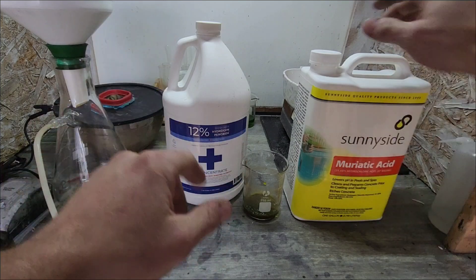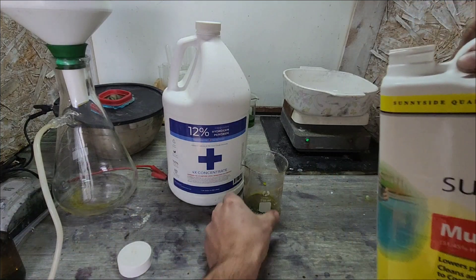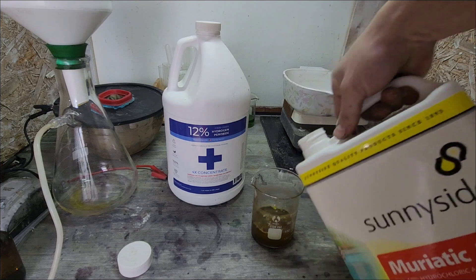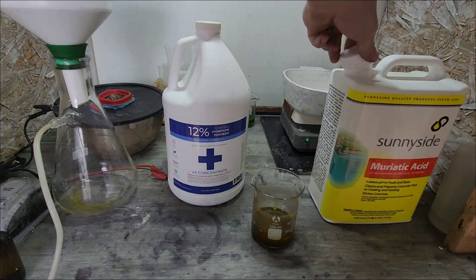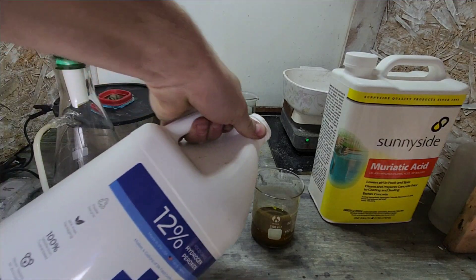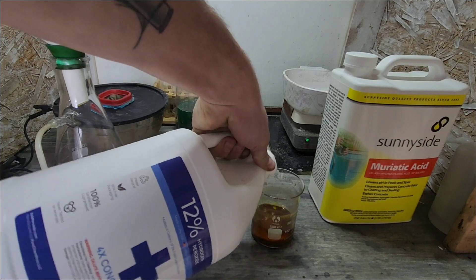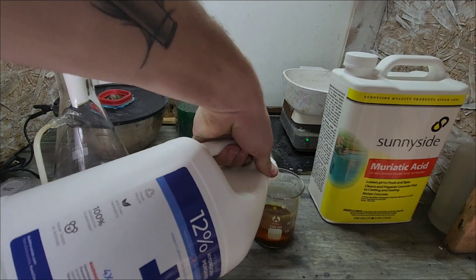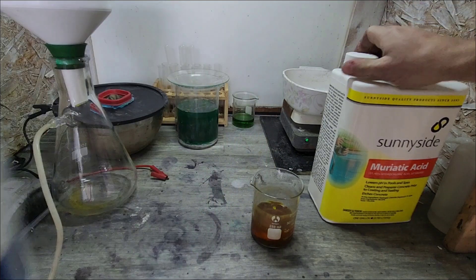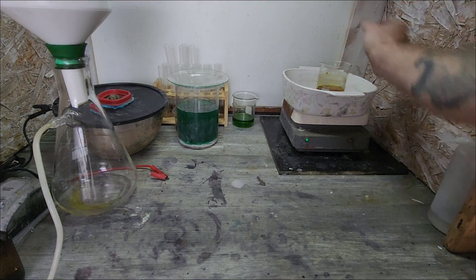We're going to go ahead and start this. We're going to add some hydrochloric and a little bit of hydrogen peroxide. We'll go with a little bit more than that. Alright, clear the workstation and go ahead and throw this bad boy up on the heat.